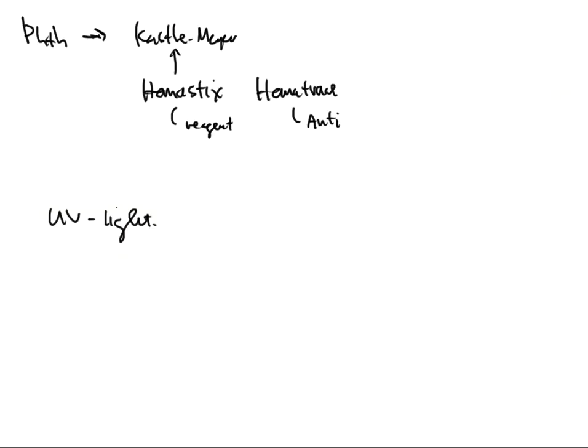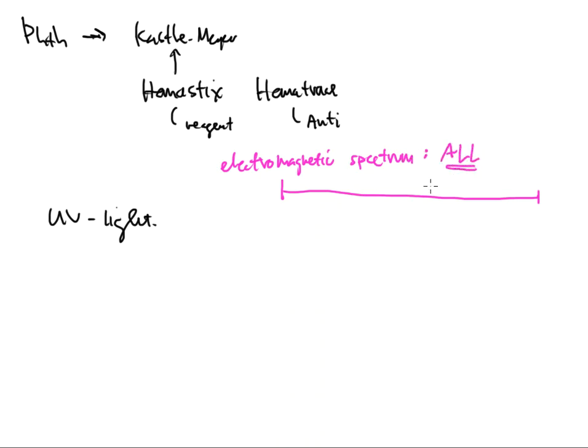For those of you that maybe are not in the instrumentation course yet, let's talk about the UV region. Here we have what we call the electromagnetic spectrum. I'm going to write that out: electromagnetic spectrum. The electromagnetic spectrum includes all energies. When I say energies, I want you to think of colors, but colors that your eyeballs cannot necessarily see. What we see is a very small sliver of that spectrum, and we call this the vis portion of the spectrum.